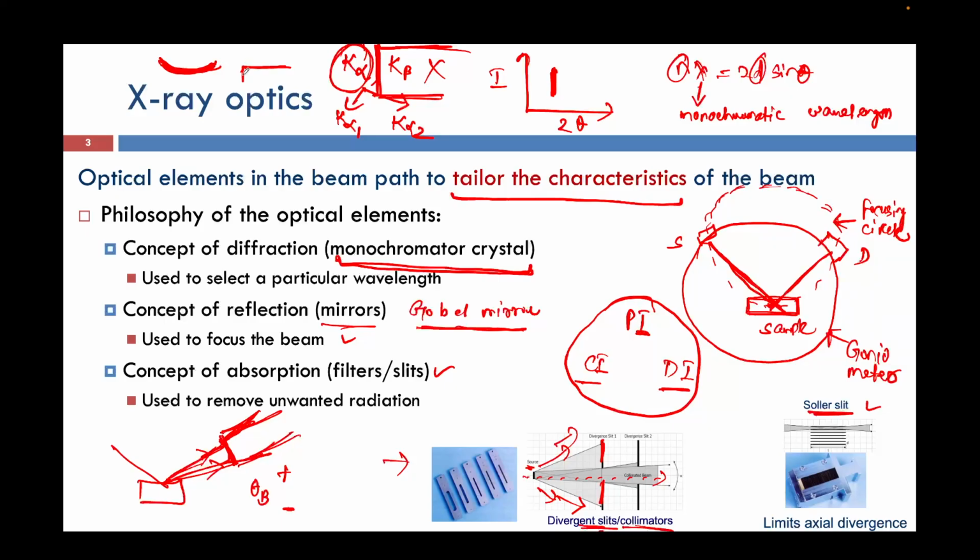So in real life our samples are always flat, and since they are flat, we are never going to get a single line in the X-ray diffractogram. That is why we always get some amount of broadening due to this instrumental constraint, because we are never going to make an exact curved surface whose curvature will match this circle.